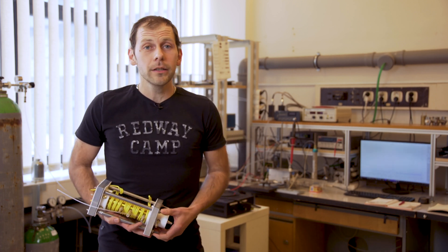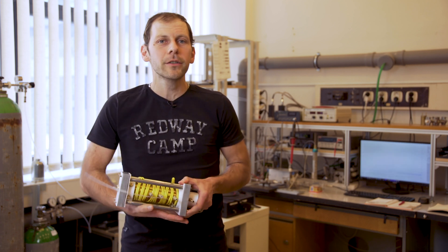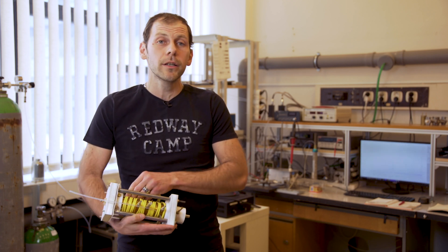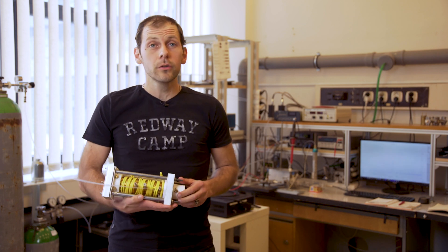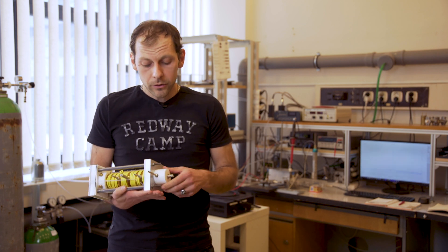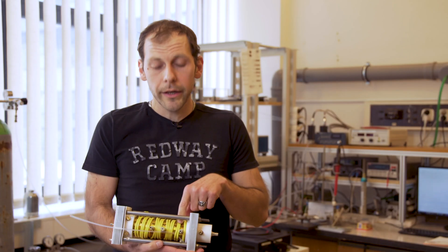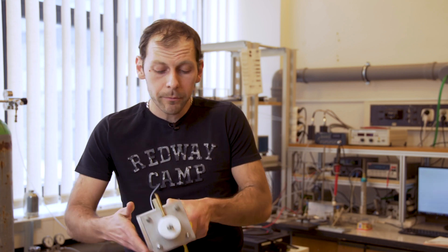Firstly, the ion mobility spectrometer which I'm holding in my arm. It's a very small tool and it's very easy to measure with. The spectrometer consists of an ion source at the top, continued to the reactive chamber, the drift tube, and at the end there is a detector.